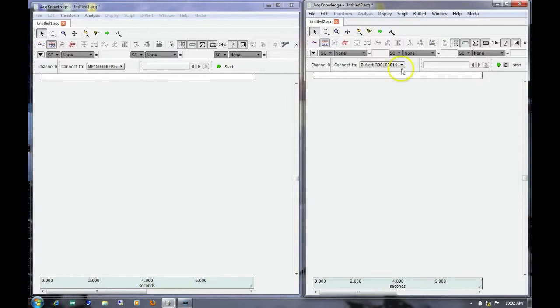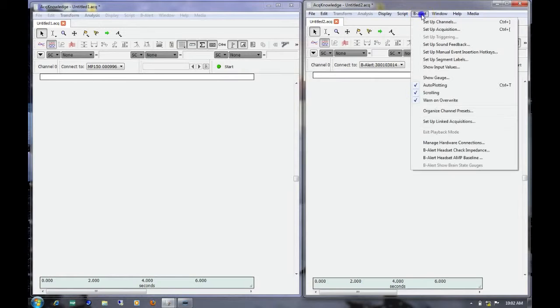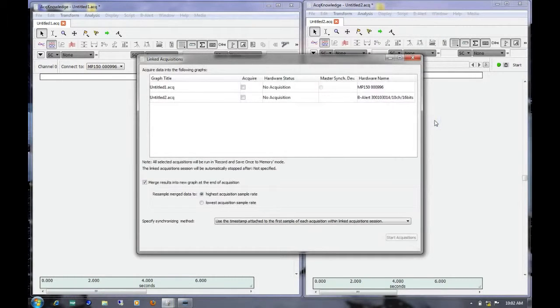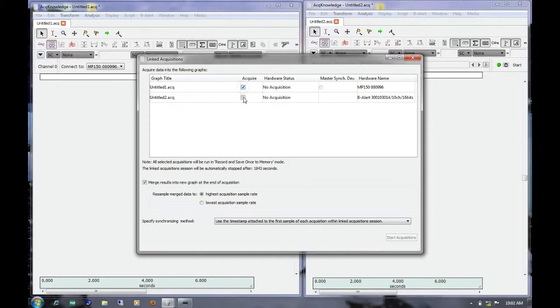Once we have both windows ready to record, we can go up either to the MP150 or BeAlert menu option and select Set Up Linked Acquisitions. This will bring up a dialog box that shows both of our devices that are currently connected and their graph windows. We'll choose to acquire data from both, and then we have to choose how we'd like to synchronize our data.